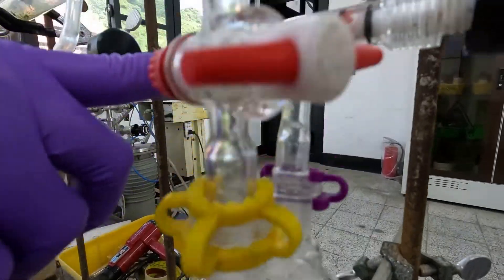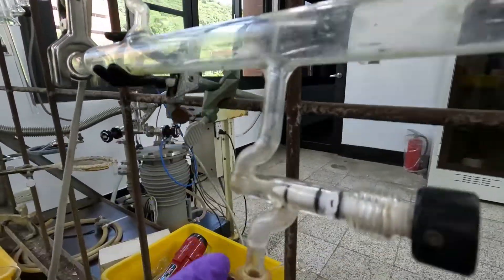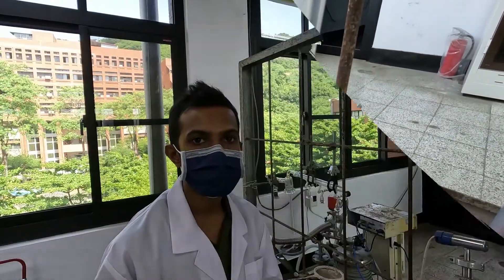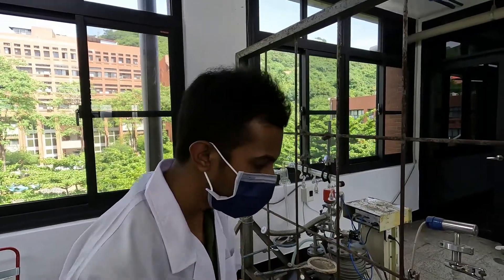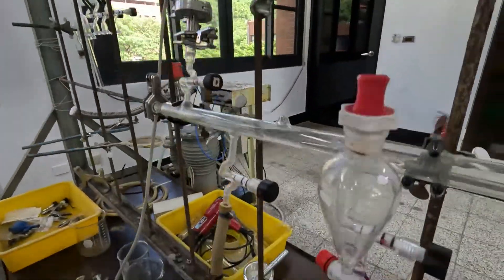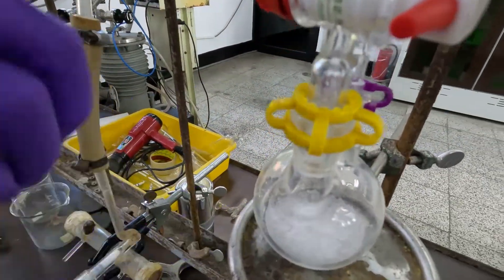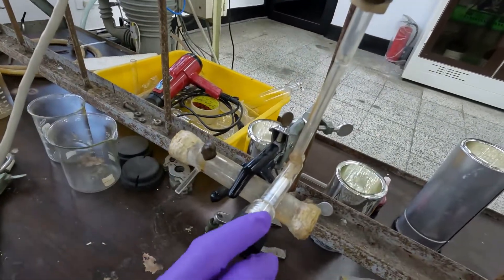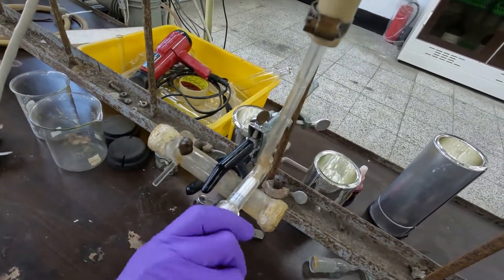This HCl gas enters the setup and is collected into the IR cell. After 5 minutes, you can see the reaction is almost done and we have collected enough HCl for the IR cell. Then you can close the dispensing valve.